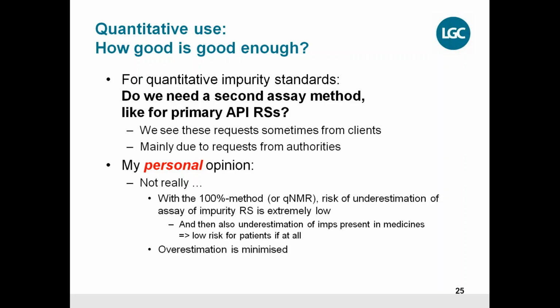The overestimation at the same point is minimized because we look at water and at the residual solvents, so overestimation is also minimized, and the economic risk that I have explained before is then minimized as well.